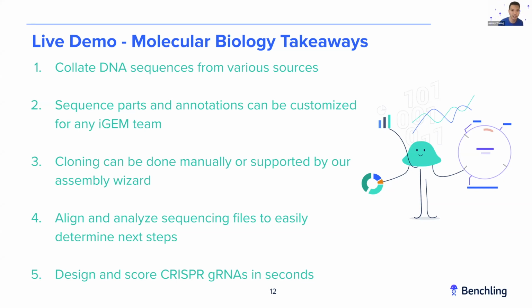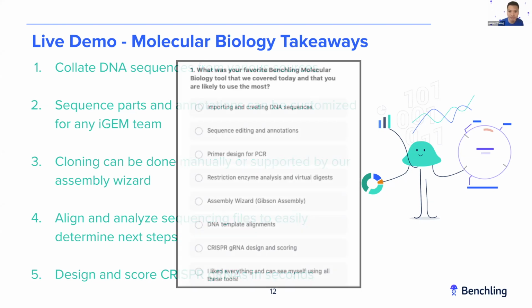All right. Now we're getting ready to wrap up, but I actually want to hear a little bit more from you all about which features you were really interested in today. I'm just going to give you a really quick poll about what your favorite feature was today. If you have a chance, unfortunately you only have to choose one, which one would it be? We'll give a little time for everyone to put in their responses, and we'd love to hear everyone's feedback, especially so we know what iGEM teams are thinking about the most, and also what aspects of Benchling we could improve even more.